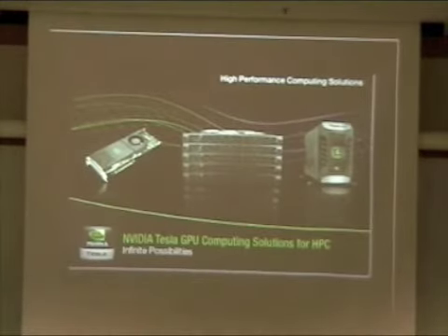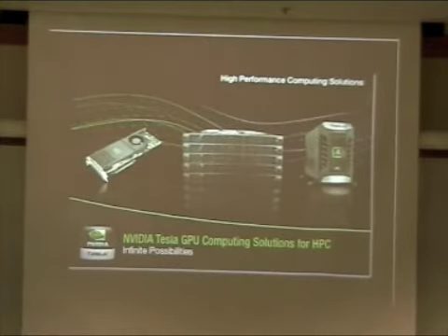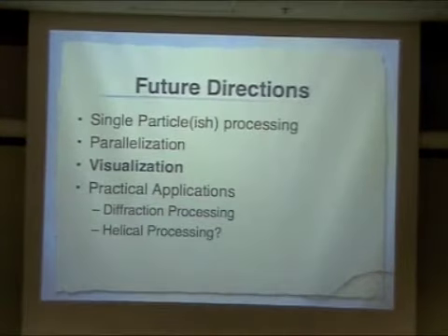So most of what we write now is being geared more towards this schema. Do you need a Tesla or an NVIDIA graphics card? Of course not. We're writing it so that it just takes advantage of multiple processors.